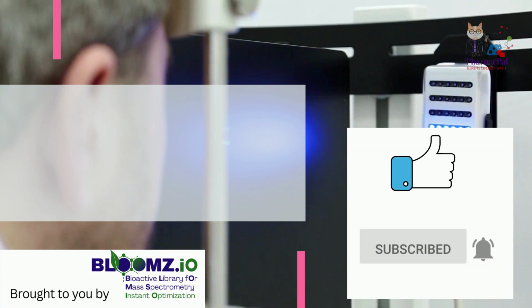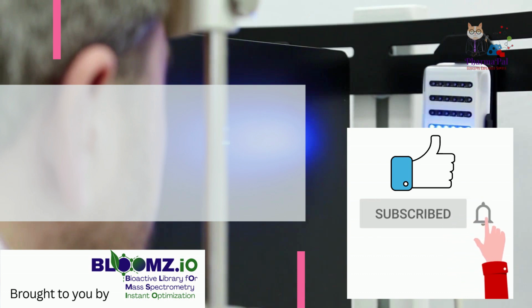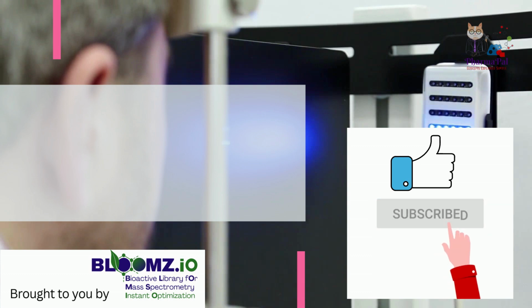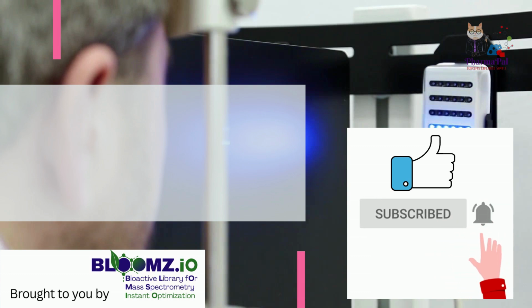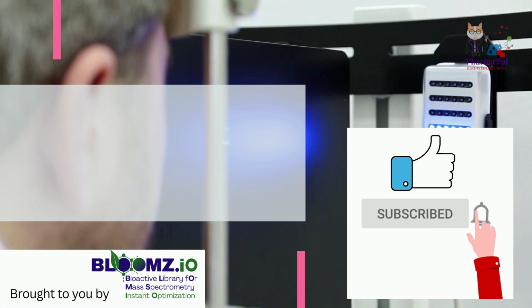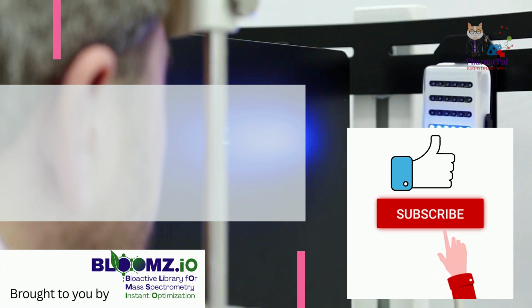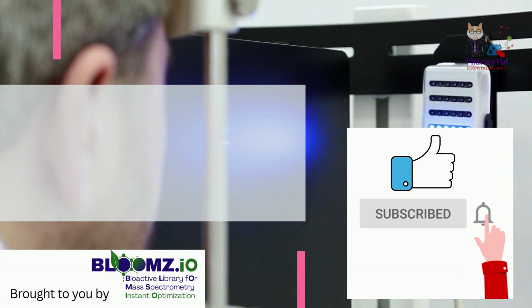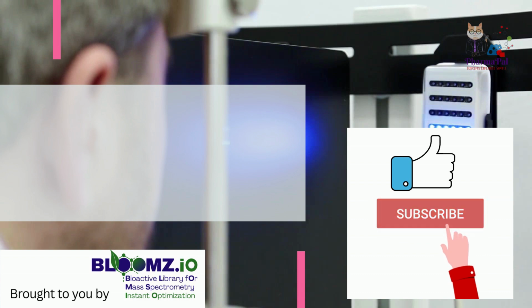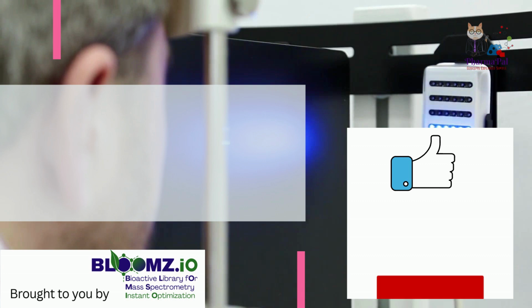So it's really a cornerstone tool then. Not just identifying what's there, but pinpointing the active components by linking that chemical data directly to biological results, especially through careful tuning and analysis. Couldn't have said it better. For a phytochemist, it's fundamental for dissecting that natural complexity and finding the molecules that matter. So for you listening, if you're in this field, understanding how to use and, crucially, how to optimize mass spec for your specific needs, identifying unknowns, handling complexity, is absolutely key. It's your window into the molecular world of natural products.